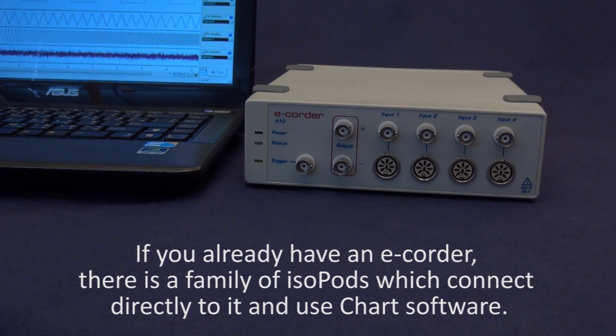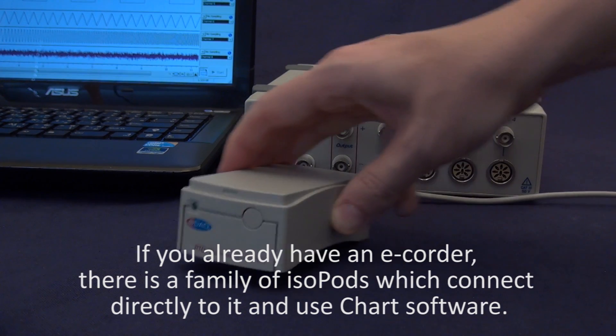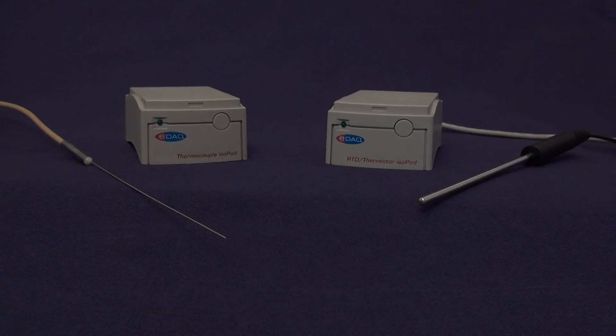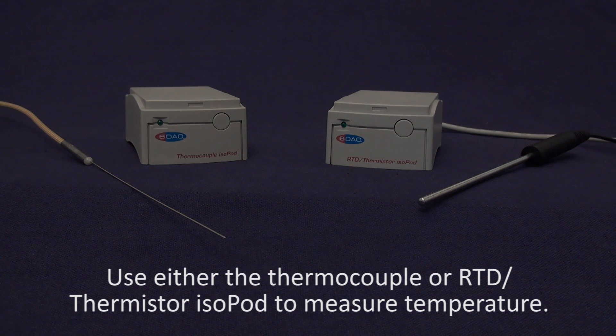If you already have an ecorder, there is a family of isopods which connect directly to it and use Chart software. Use either the thermocouple or RTD thermistor isopod to measure temperature.